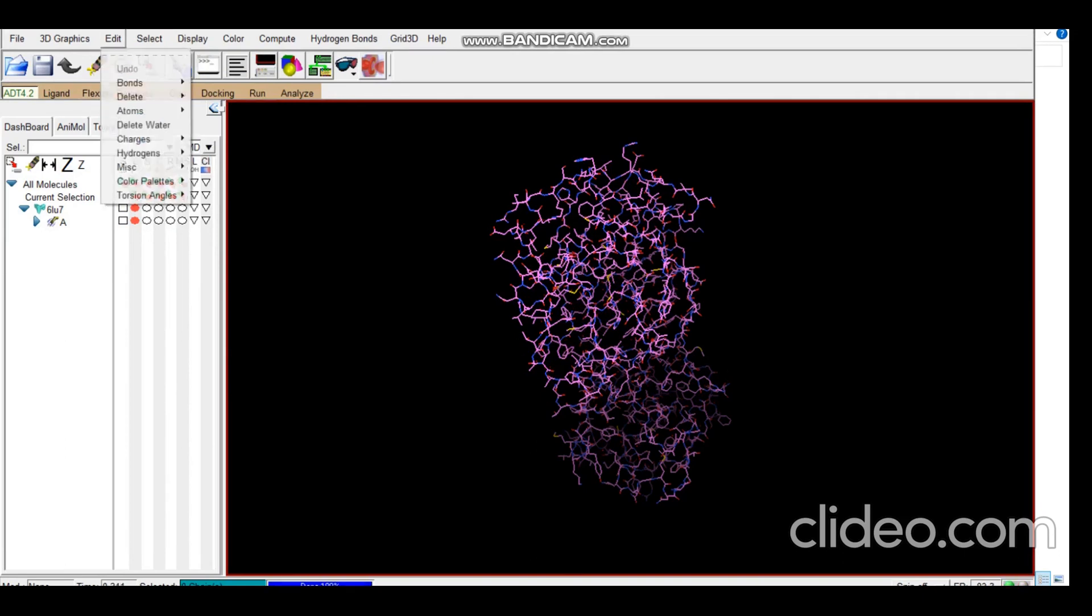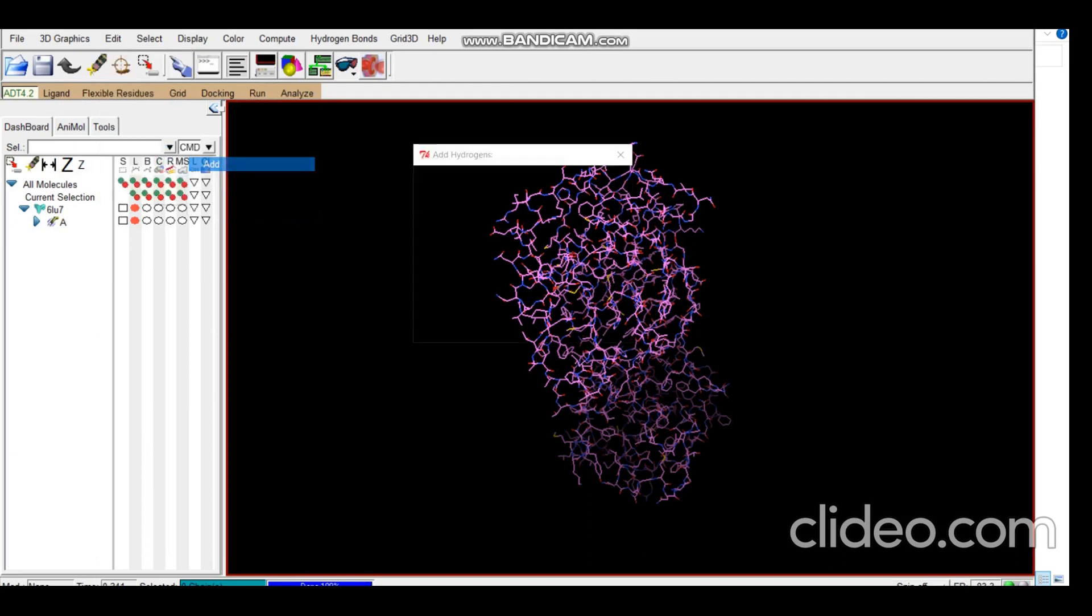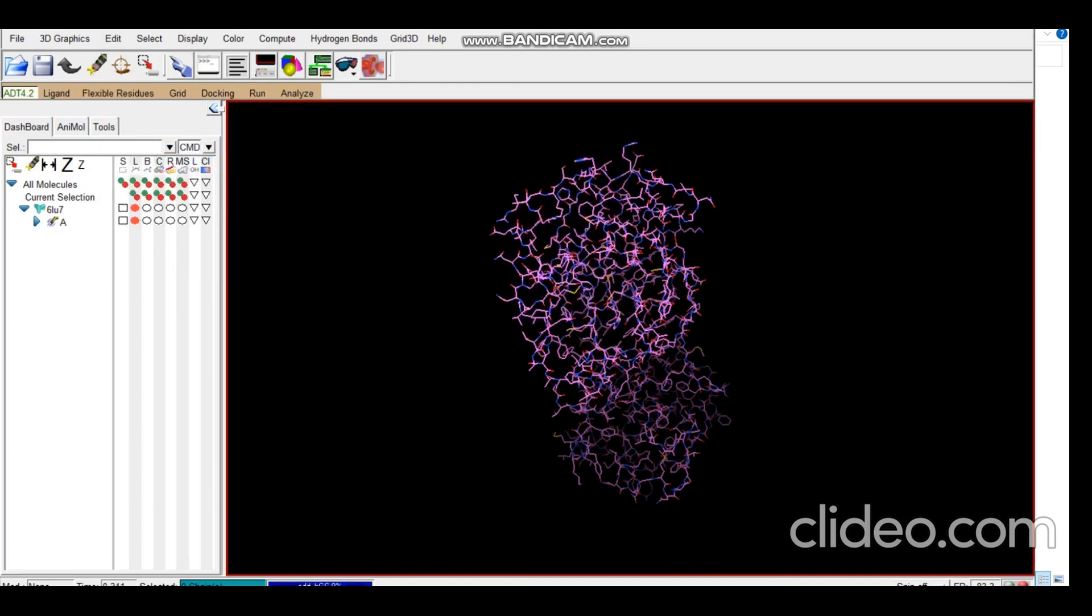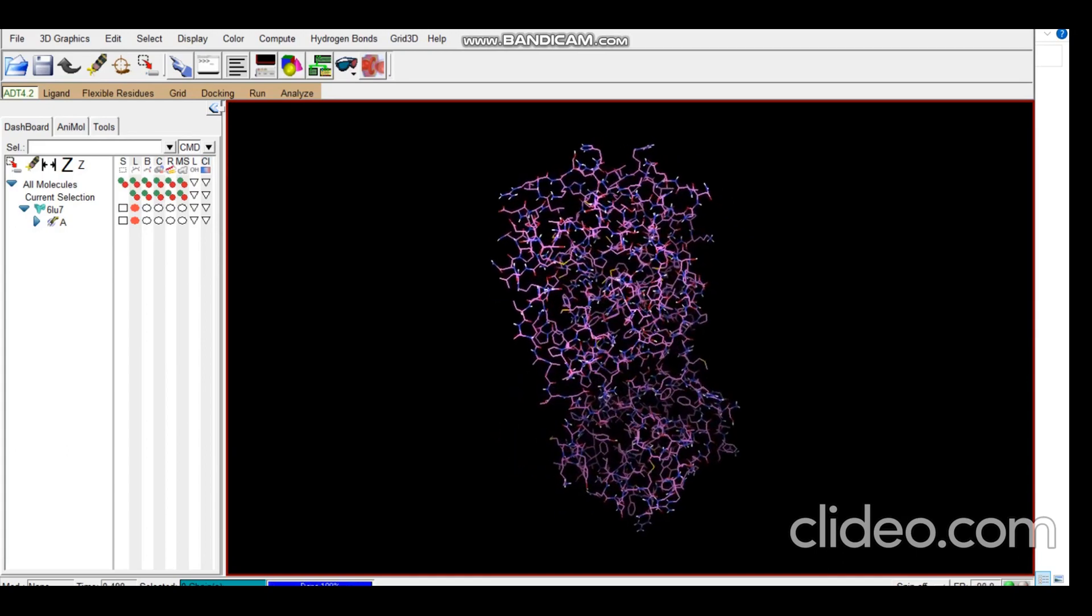Then we add hydrogens. Here we add only polar hydrogens. You can see the polar hydrogens have been added.